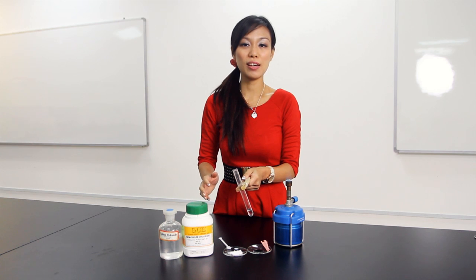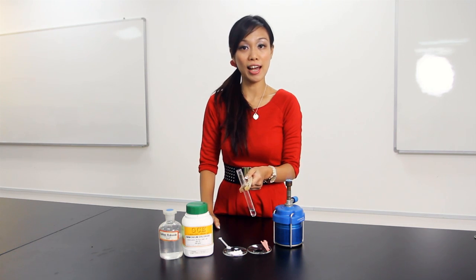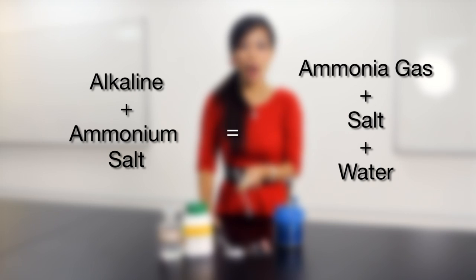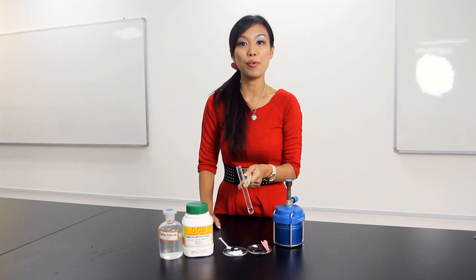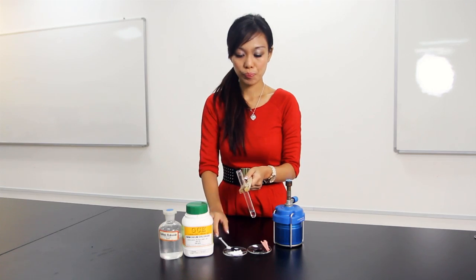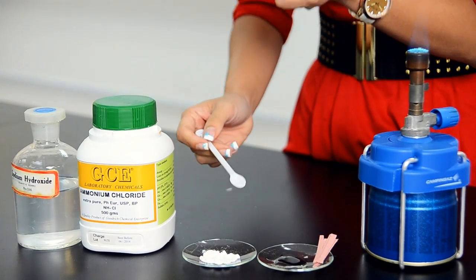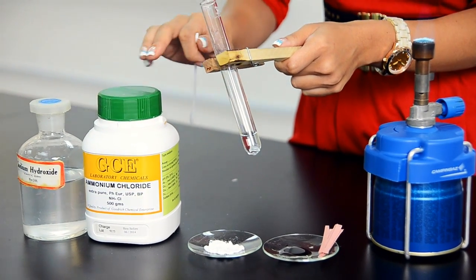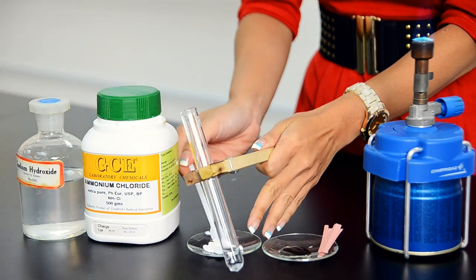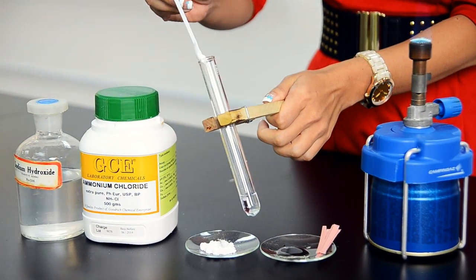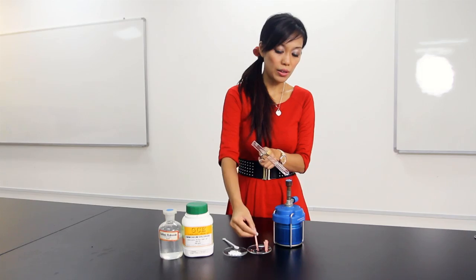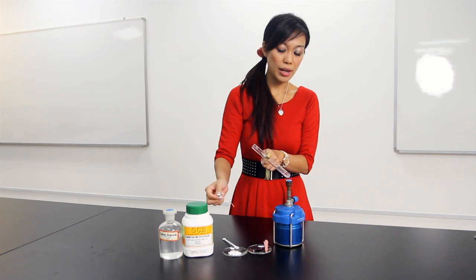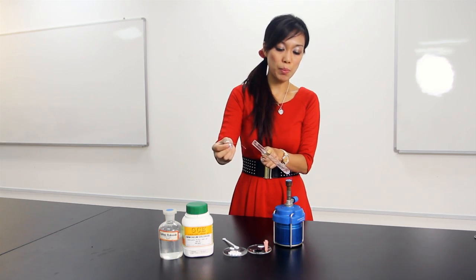Another very important reaction of alkaline is when alkaline reacts with ammonium salt — ammonia gas will be evolved. Ammonia gas can be tested with a red litmus paper; it will cause a damp red litmus paper to turn blue. I have with me here sodium hydroxide already placed inside this test tube, and I have ammonium chloride. When I react a little bit of ammonium chloride with sodium hydroxide, that will cause the red litmus paper to turn blue.